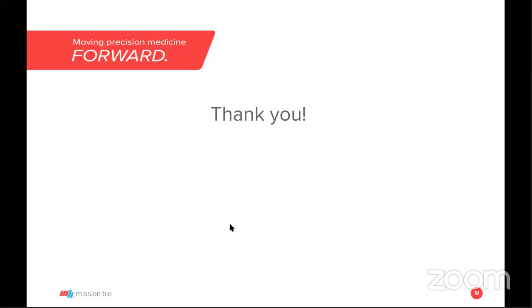Great, Jim. Thank you so much for taking us through Tapestri Designer and all the new features in 2.0. I think our customers are going to be really excited to be able to do the whole genome and mouse. So we had a couple questions come in. Can you comment on how to design for CRISPR edits where you can have tremendous variation from cell to cell in the types of indels that are created?